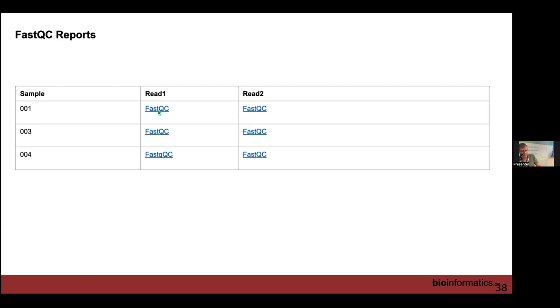We see higher AT content and lower GC content in this case. And because of the base pairing, we generally see A and T go together, and G and C. GC content is a metric that's often used to understand quality issues. It could help with understanding a lot of other things as well. This is just a distribution of the GC content, at about 35% peaking here. Then how much N content we have, how many missed call bases, and a sequence length distribution in this file. Everything is 151 bases, so it just peaks there.